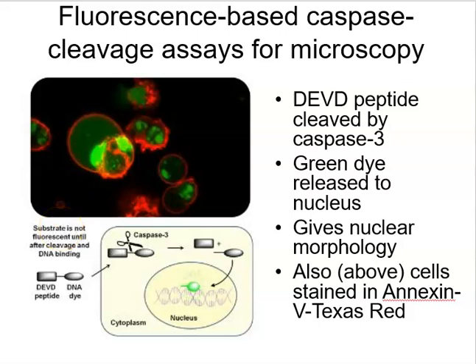Either later on in the module or possibly in your flow cytometry lectures, you might have come across Annexin V staining. I'll not elaborate on it here, but this can also be used to further clarify that these cells are apoptotic. So if you've not covered that yet, you will cover that in a future flow cytometry lecture.